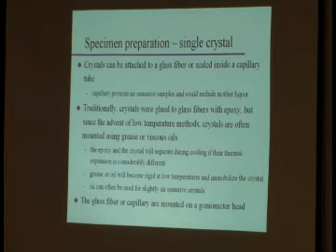In the old days, people used epoxy to glue their crystal to the glass fiber. And the main reason behind that was, once something is in epoxy, it's in epoxy. It's going to stay on the glass fiber. You didn't want things to fall off, okay? Nowadays, you will rarely find people using epoxy.